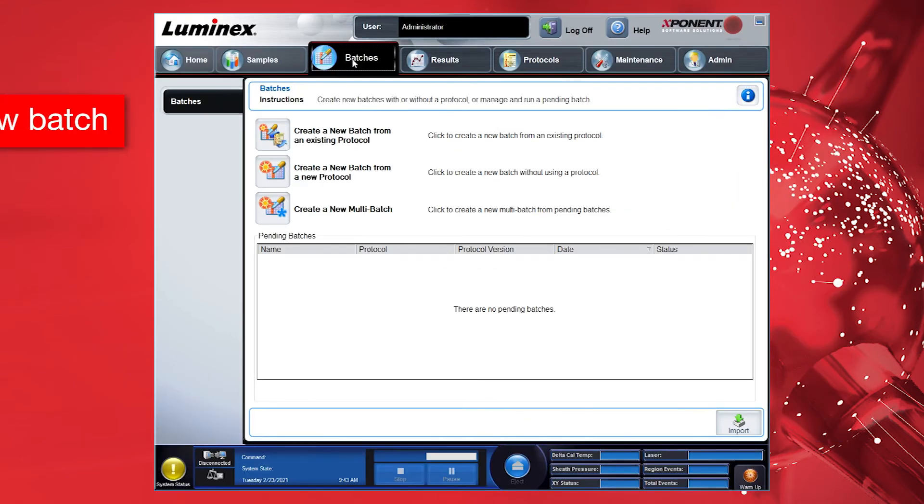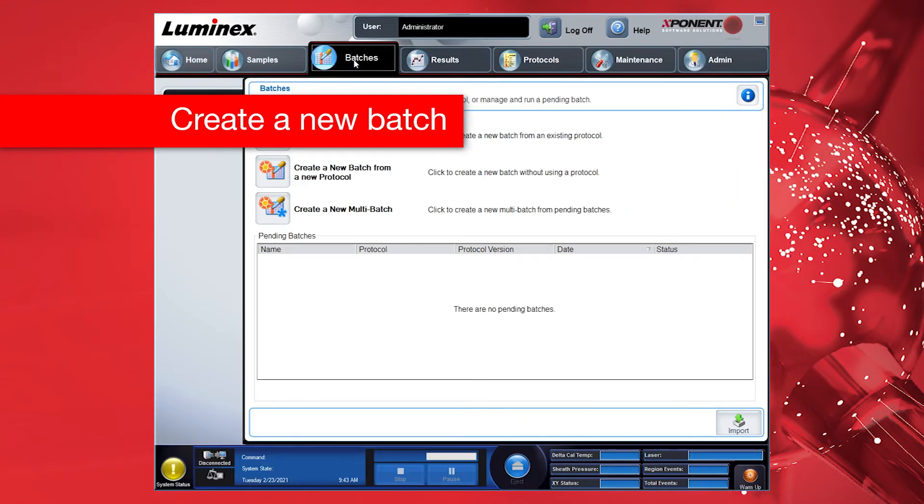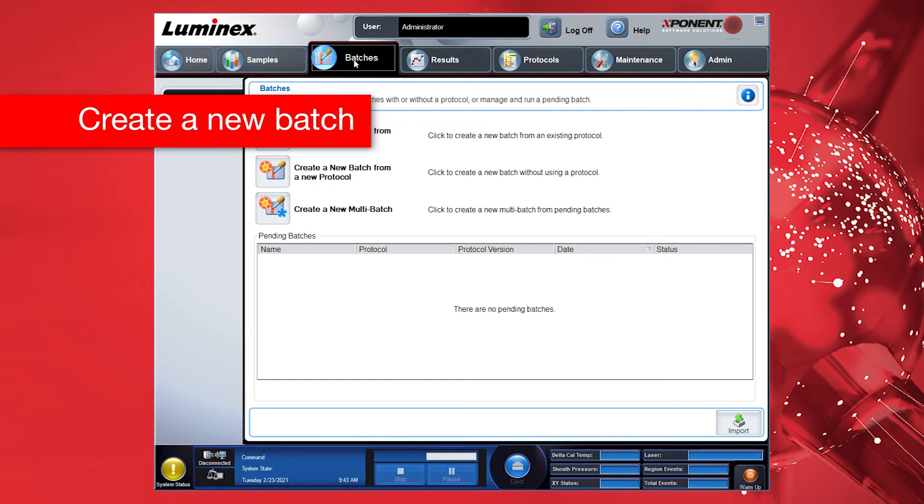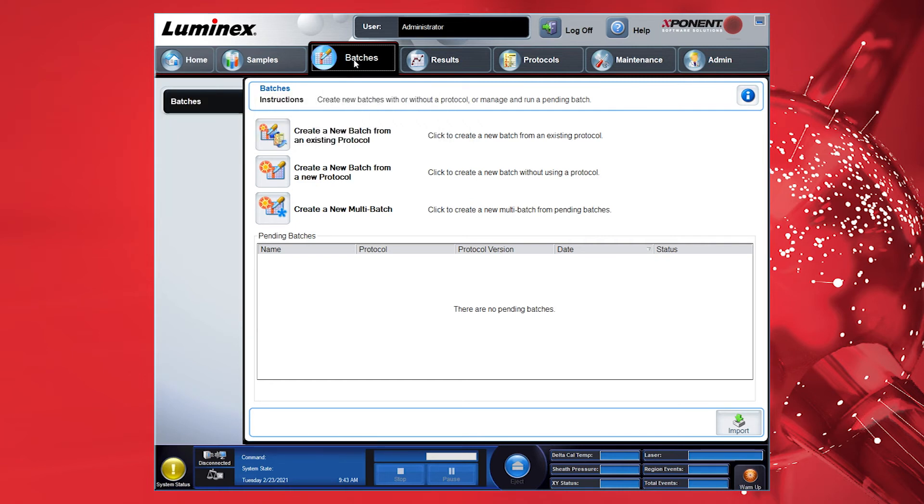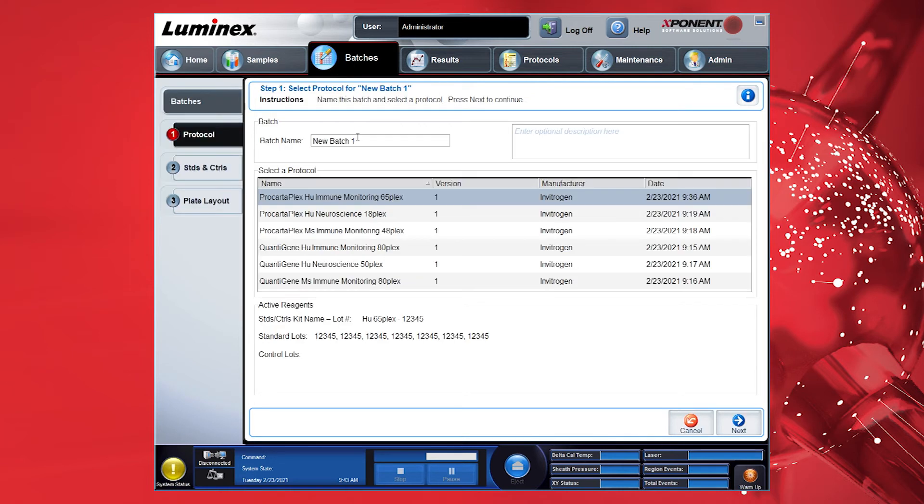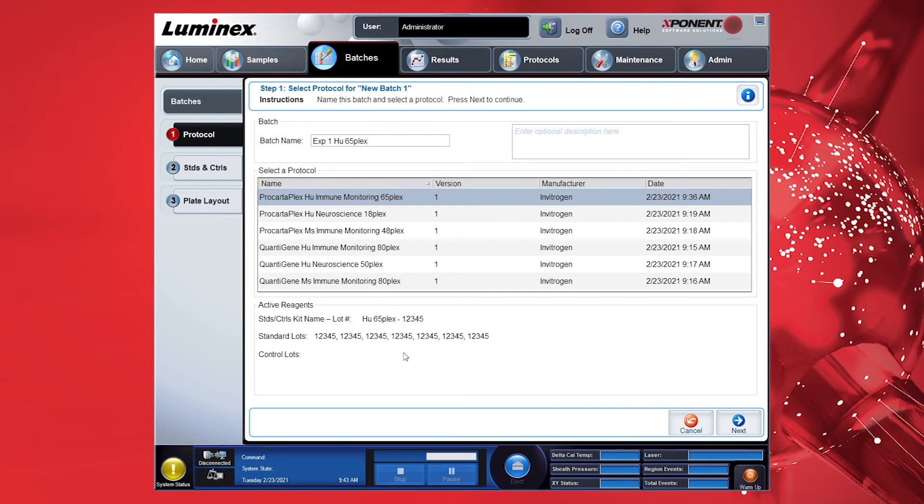Now switch to the tab Batches. In this section, you define your experiment and run the assay. Name the batch which best describes the experiment. Select the protocol you want to use for running the assay. Then click Next.